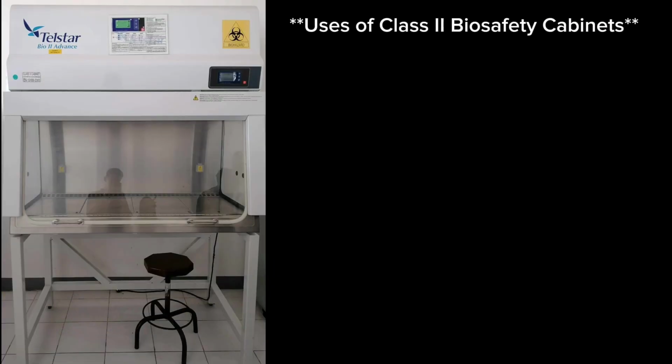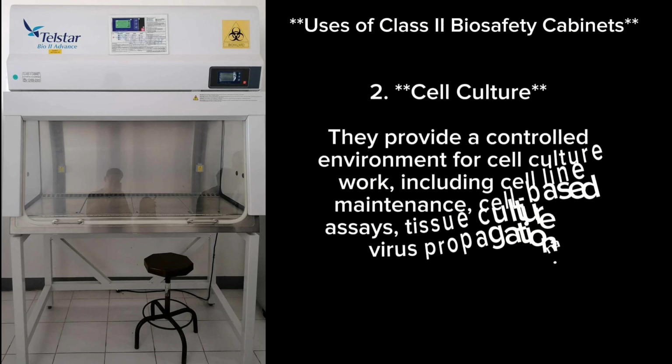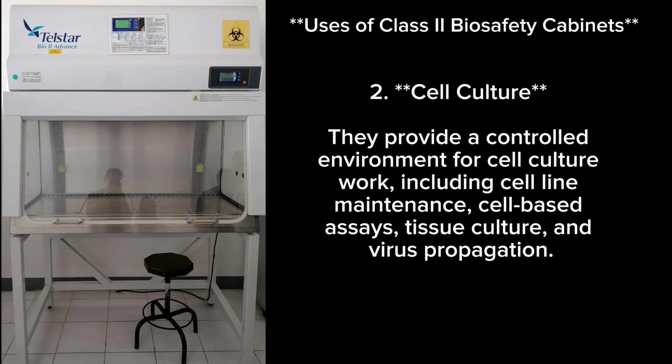Uses of Class 2 biosafety cabinets in microbiological research and cell culture. BSCs are extensively used in microbiology laboratories for various tasks such as culturing bacteria, viruses, fungi, and other microorganisms, as well as handling biological samples and conducting experiments. They provide a controlled environment for cell culture work, including cell line maintenance, cell-based assays, tissue culture, and viral propagation.